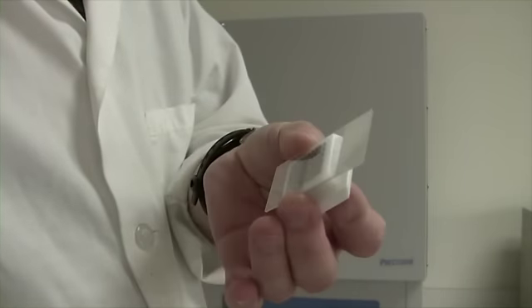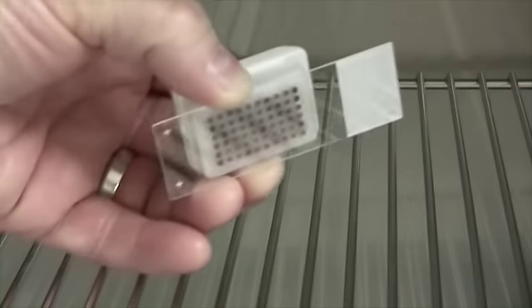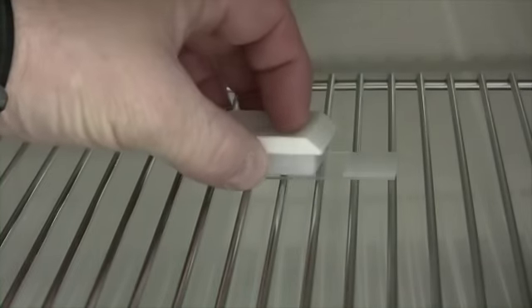Some people like to leave their array blocks in the oven overnight to soften and set the punches, but we have found 2 to 4 hours works just fine for us. You may want to test this for yourself because some tissues might need more setting time.